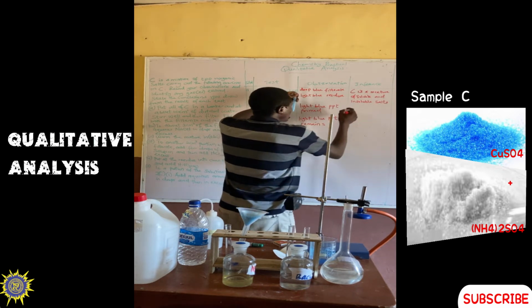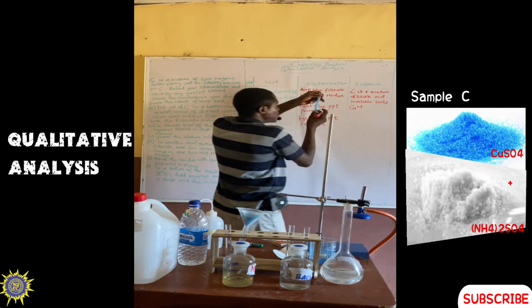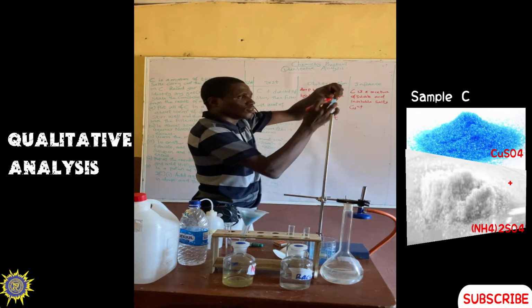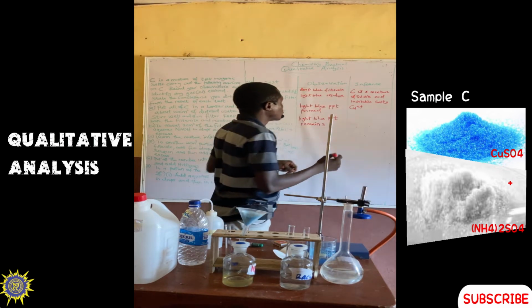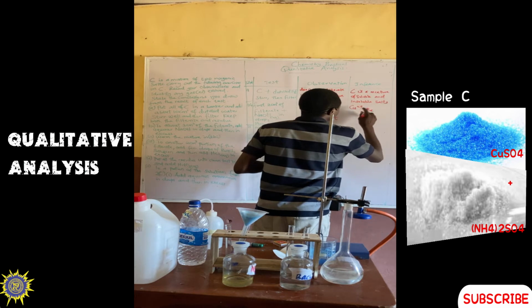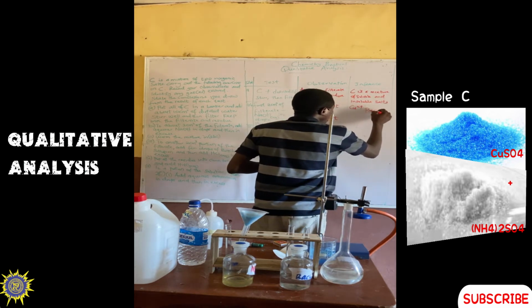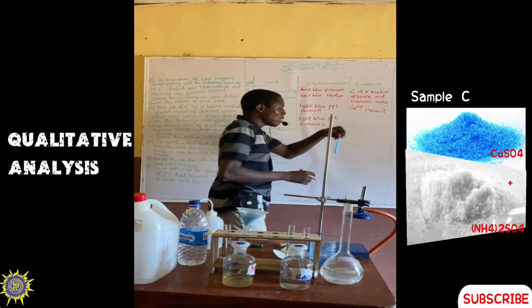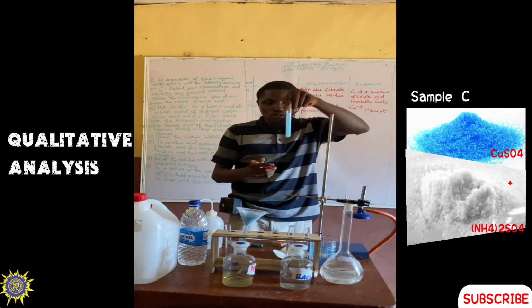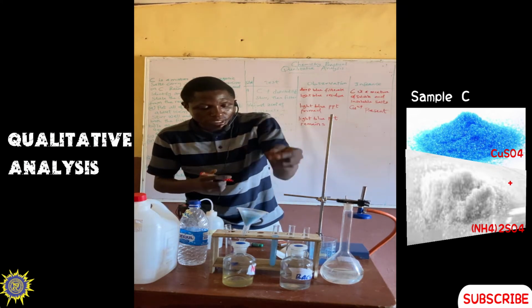So what does it mean? It means that this solution, this filtrate, consists of Cu2+, which is the copper ion. So the copper ion is present in this mixture.